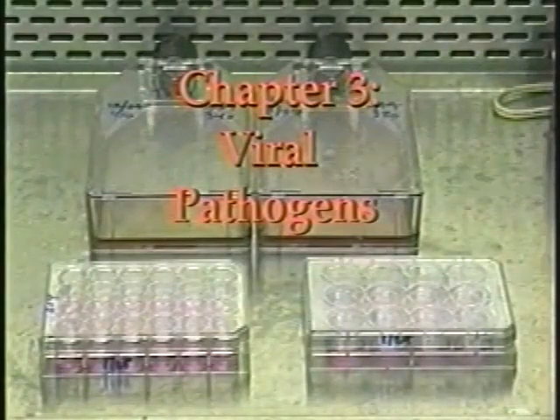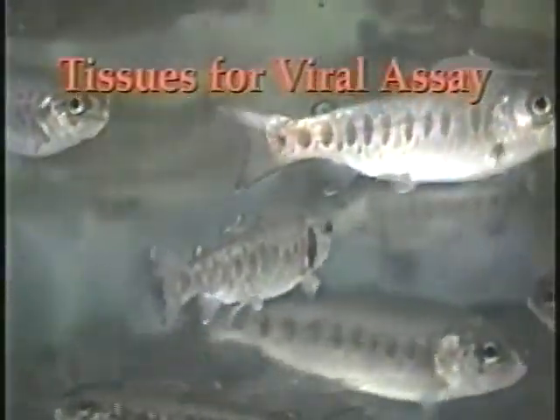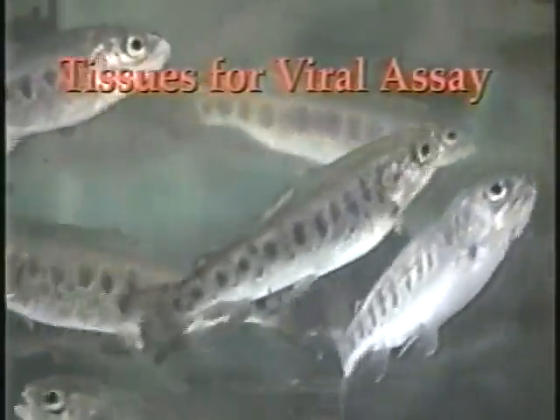This chapter covers collection and handling of samples for virus assay. Because most methods for virus identification require having facilities for maintaining fish cell lines, those techniques will only be introduced here. Samples for virus assay are routinely collected from adult fish and from fry, but may be taken from any size fish, particularly if a loss is occurring.